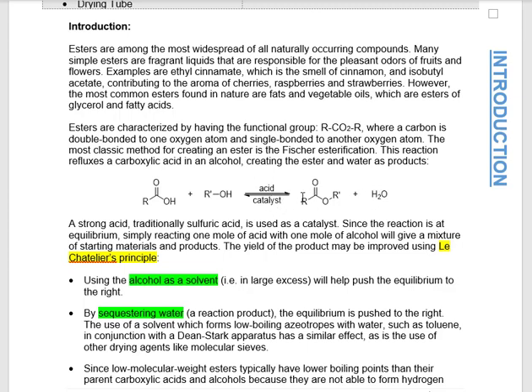Another thing to notice here is that in this reaction, you make an ester, but you also have water as a product. That can come in handy when we look at the arrows here. This reaction is in equilibrium, so it doesn't just push forward and create nothing but the ester and water. It's got a balance to it based off its equilibrium constant.